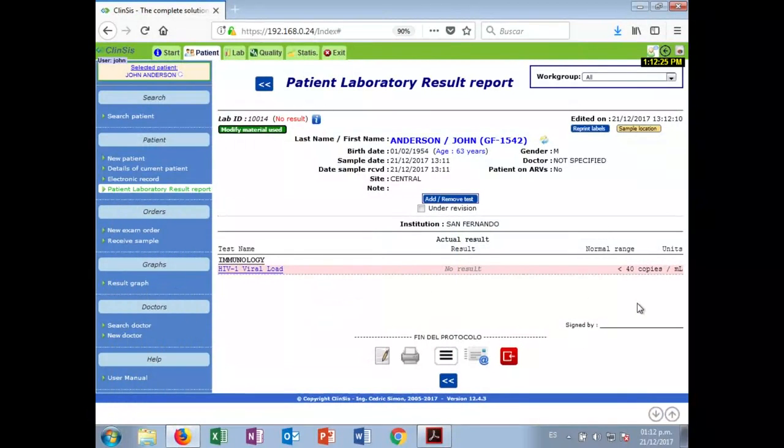Remote access can be given to the doctors or hospital in order to review and print the result of their patient online. Remote access can also be given to auditors in order to review statistical report related to the processed test.